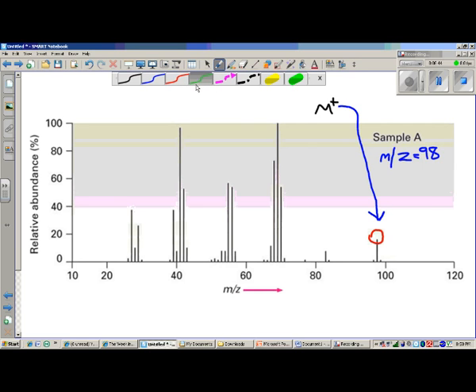Now one thing you're probably wondering is, well, hang on a minute, that peak isn't furthest to the right in that spectrum. What about this tiny little one here? This one right here. I'm not blind, I can certainly see that that's there. There's always going to be at least a peak that's either very small, or depending on what atoms are in there, of smaller size or similar size, next to the molecular ion peak, just slightly bigger than it.